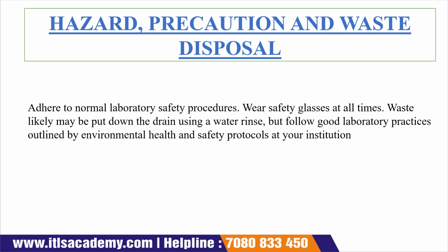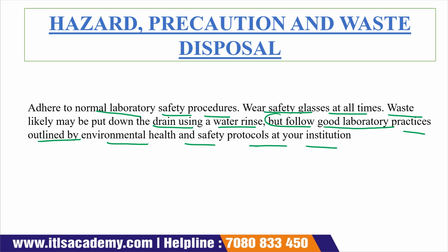Now see what is written in the slide. Adhere to normal laboratory safety procedures. Wear your safety glasses at all times. Waste likely may be put down the drain using a water rinse, but follow the good laboratory practices outlined by the environmental health and safety protocol at your institution. So this is about the hazard precaution and waste disposal.